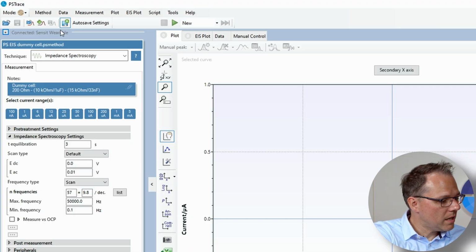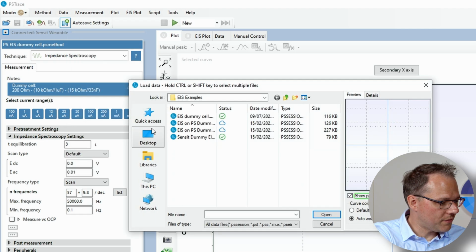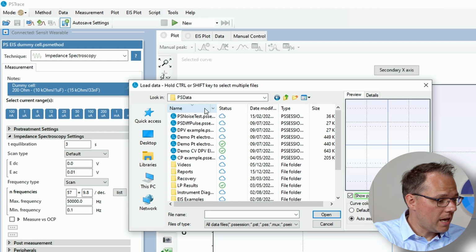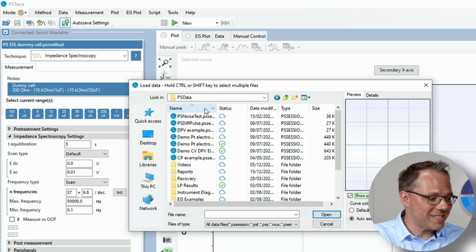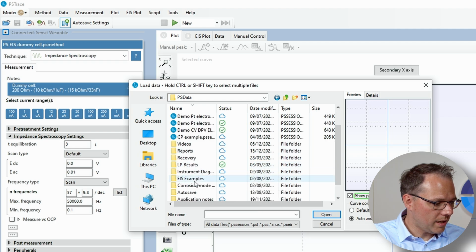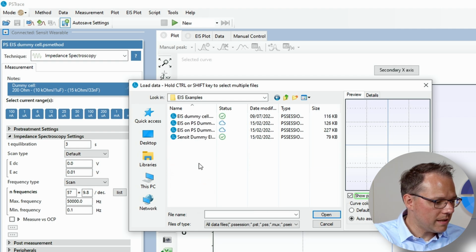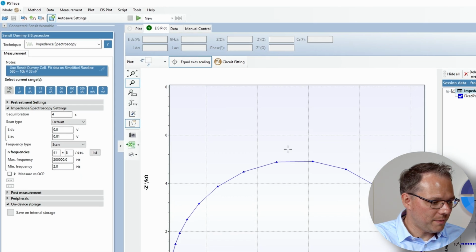So for that, I just go to Data. I go to Load Data File. And well, I'm already in the folder, but just to show you where it is. Under your documents, there is now a folder installed called PS Data. And you just look for the subfolder EIS examples, and therein Sensit dummy EIS. And I'm opening that file.